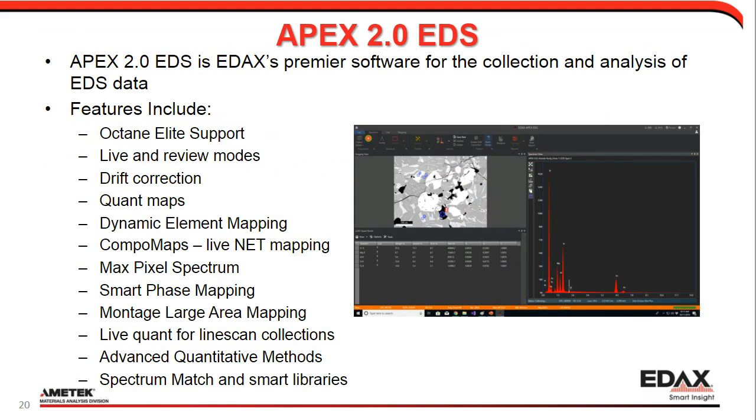Okay, moving forward, I'm going to introduce EDS specific features.